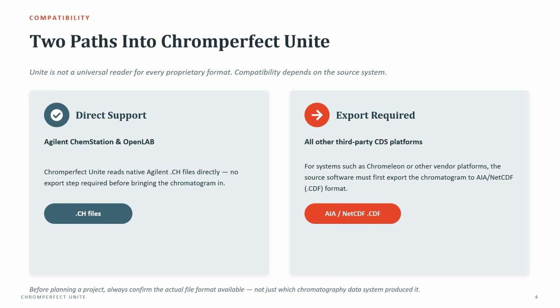For nearly every other third-party chromatography data system, such as Chromeleon or another vendor platform, the source software needs to export the chromatogram as AIA or NetCDF using the .cdf extension before Unite can bring it in. This is one of the most important things to check before starting a project. Don't just note which system produced the data. Confirm the actual file format you can supply.